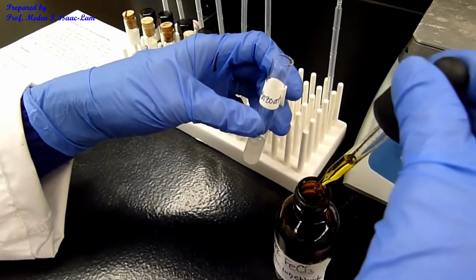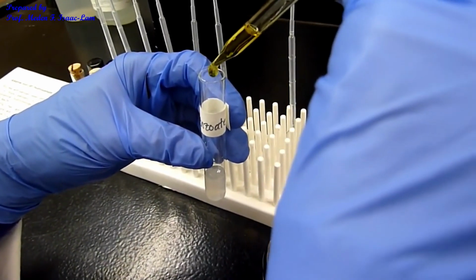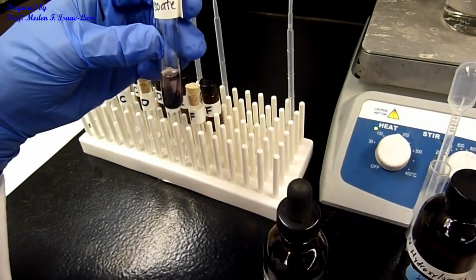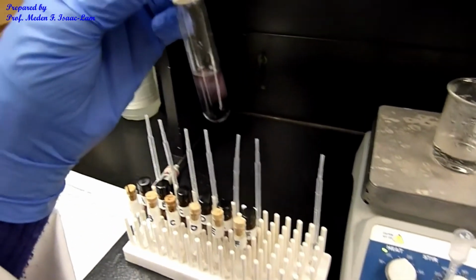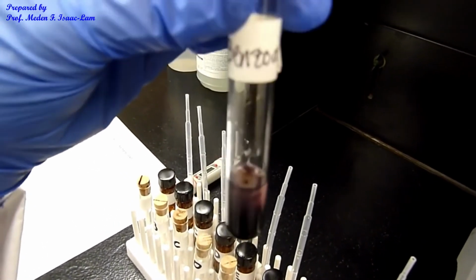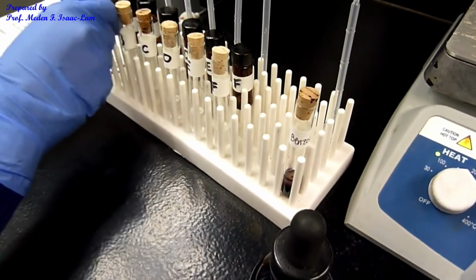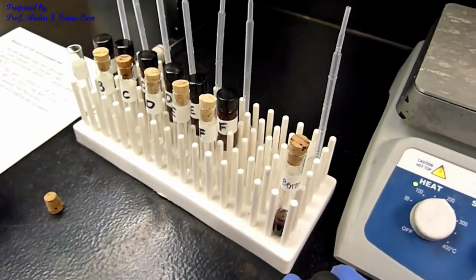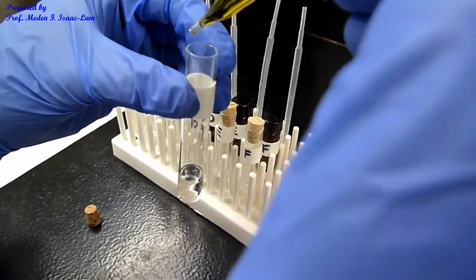So iron(III) chloride is yellowish in color. So now I have a purple color. So that's the positive test for the presence of ester. So that's what we're looking for, a positive test. So now I'm going to do the unknowns. So 1 drop of the iron(III) chloride.